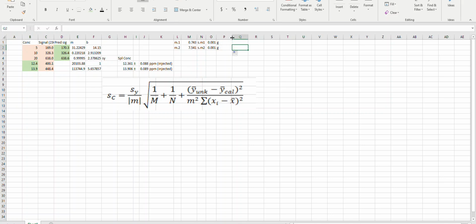Then we're also going to have a volume for the can, and a T value. Let's try it this way, 95T1. So the volume of the can is going to be 0.355 liters, right?